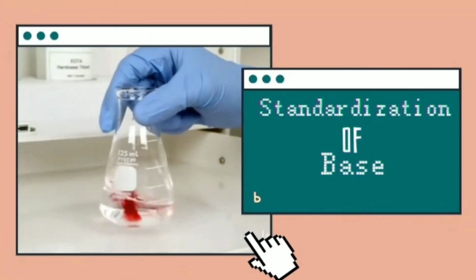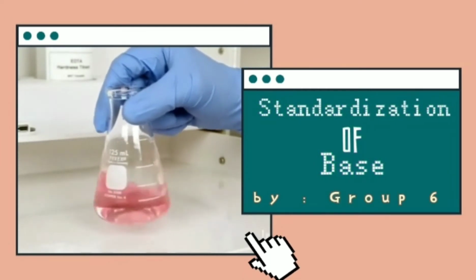Hi everyone. Today we will discuss standardization of a base.